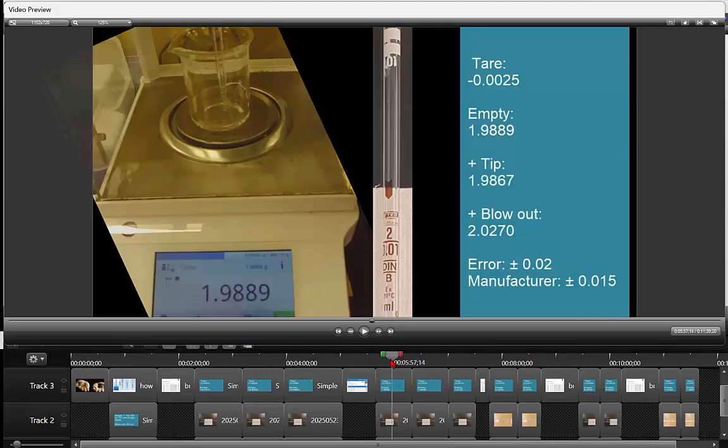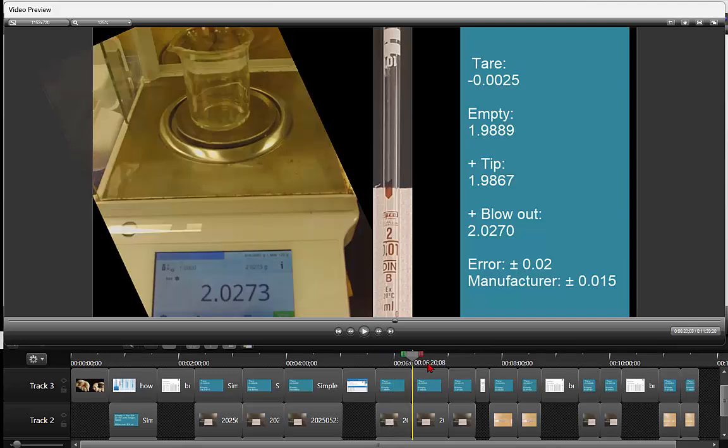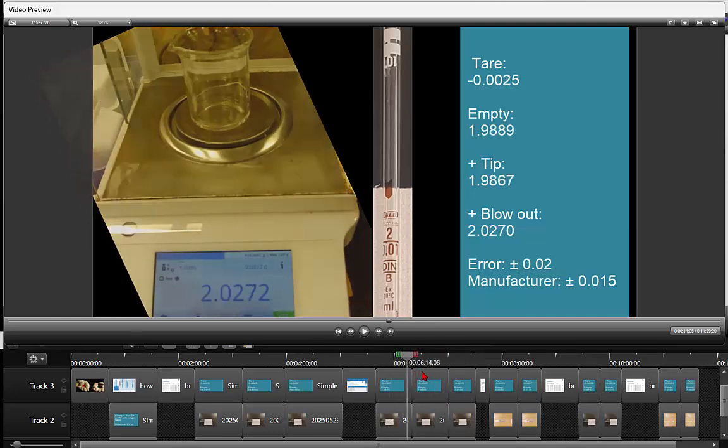Gets worse. Okay. So the next one, this one's a 2 mil one. The manufacturer here has, what is it, 0.02? What did I give them? I've given the lower one. Okay, but that's close, 0.02 each time. Even better for this one. This one is a double band, and this one does confirm you definitely need to blow it out.